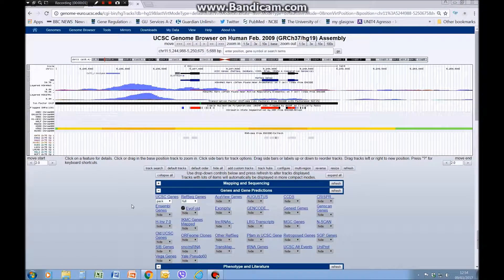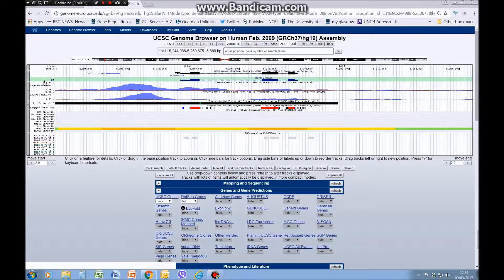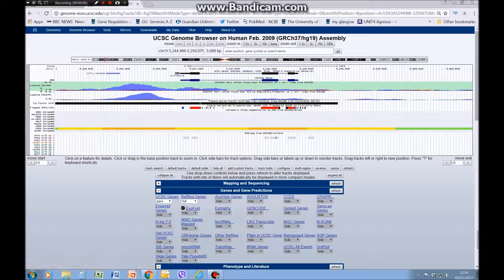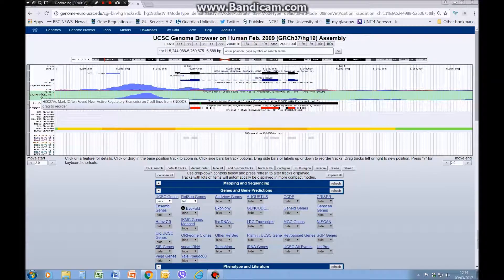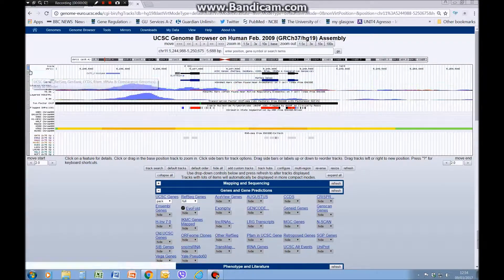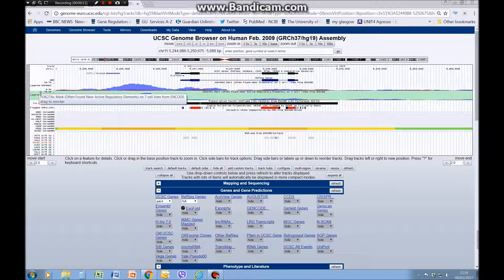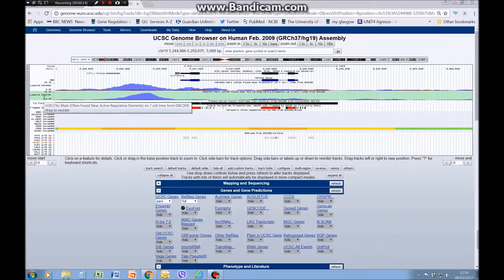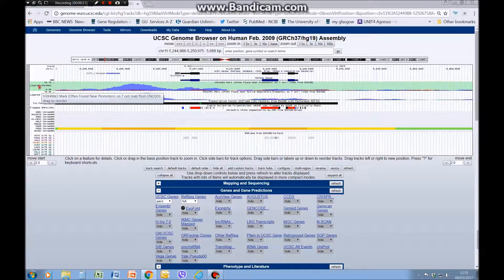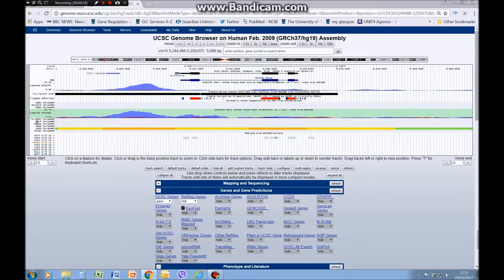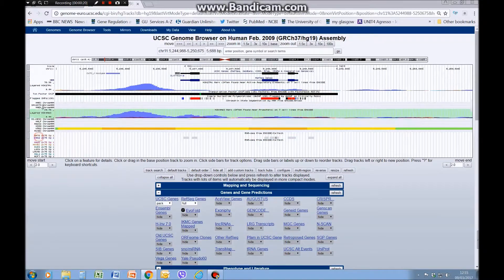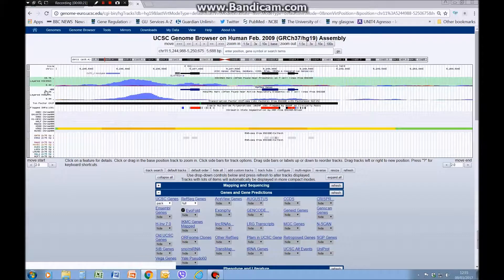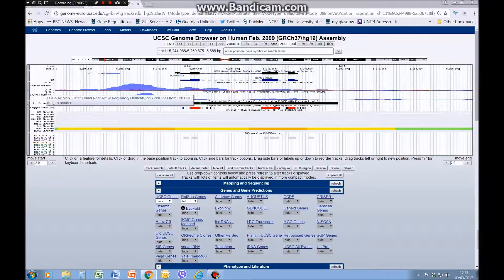Now I'm going to tell you about working with different tracks. Each of these layers of data is a different track, and simply by holding your mouse over the left-hand side you can highlight a track in green. You can move them about by highlighting, clicking, and dragging, which means you can reposition tracks to create the view that you want to show.